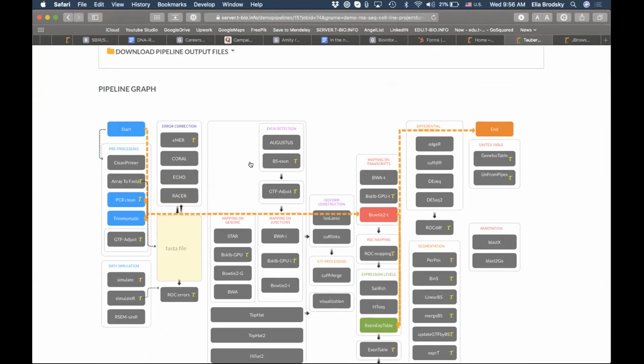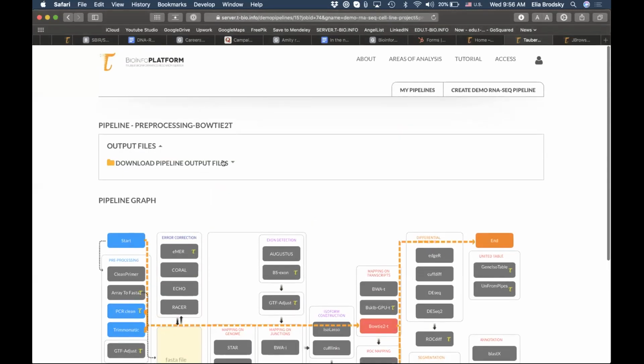The pipeline is taking the data, loading it into each one of these algorithms, and completing them as a sequential process where we take the data that goes into the input, the script or algorithm produces a result, and then we pass it on to the next job. So that's really what the pipeline is. And here what you can see is a logical representation of this pipeline. Let's take a look at the result.